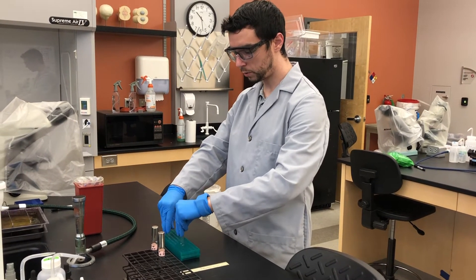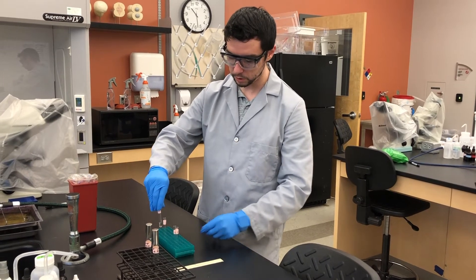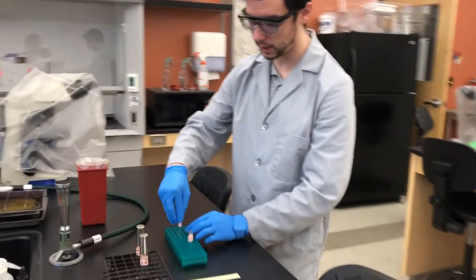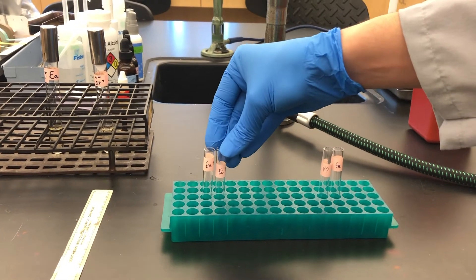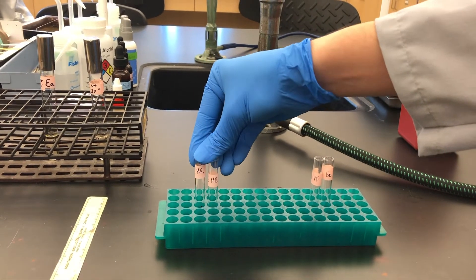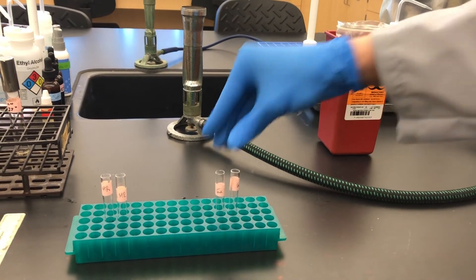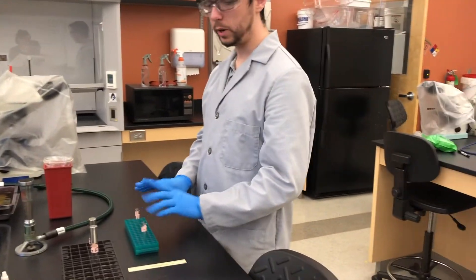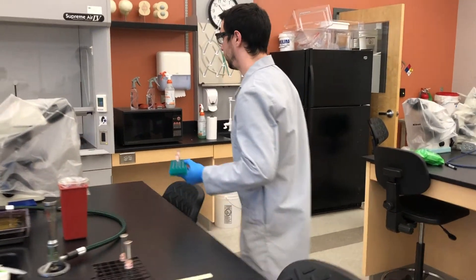Now we are going to shuffle the tubes around. Pair the two methyl red tubes together and pair the two Voges-Proskauer tubes together, so you have EA and EC methyl red tubes, and EA and EC Voges-Proskauer tubes. At this point we are ready to do the tests themselves, and we are going to move over to the fume hood.